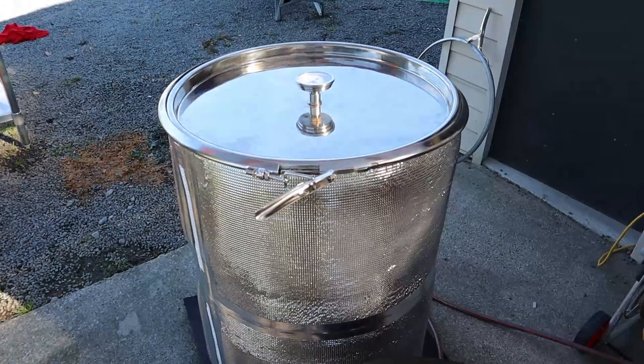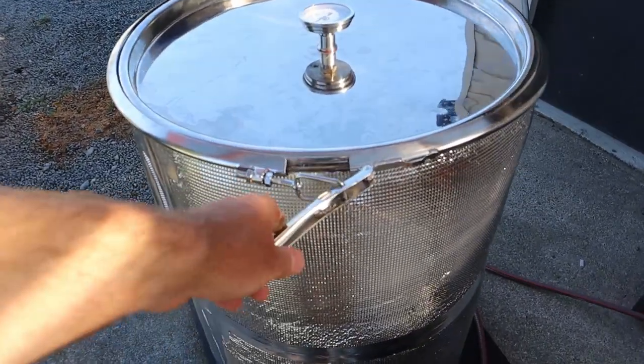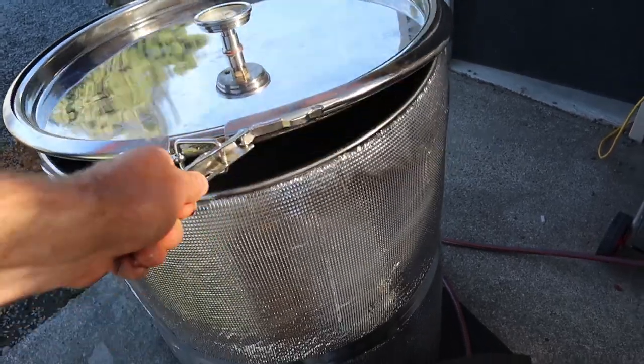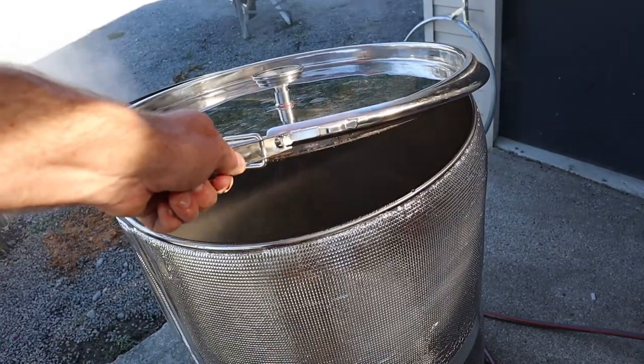In this video I'll be taking you through my steriliser build. It works quite well. If we lift it up you can really see the steam hammering out.